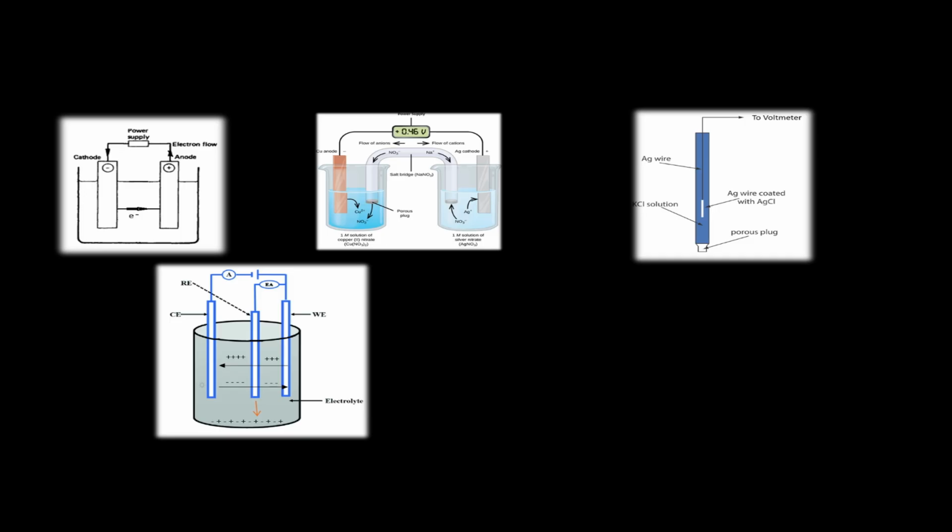It also is used to separate different electrolytic solutions and can be a single ion absorbing membrane dividing a cell into two half cells.